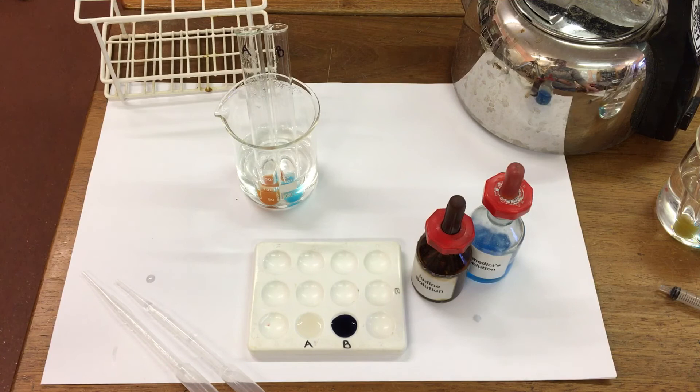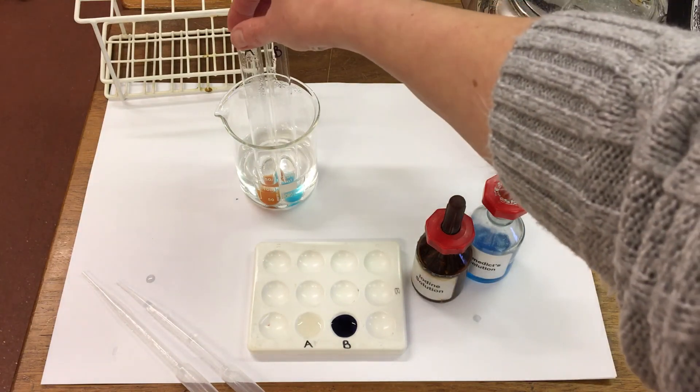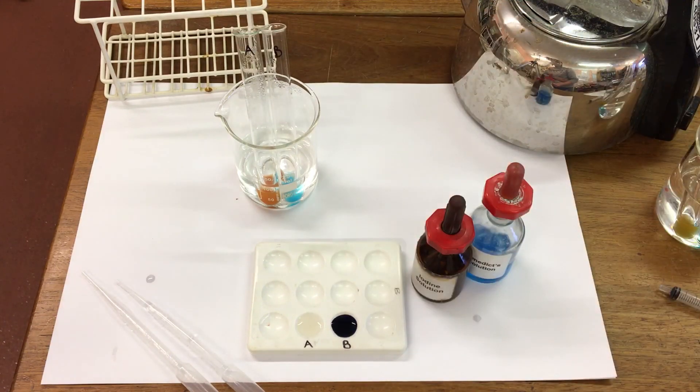So in conclusion, we can say that amylase has broken down all the starch in test tube A and produced glucose.